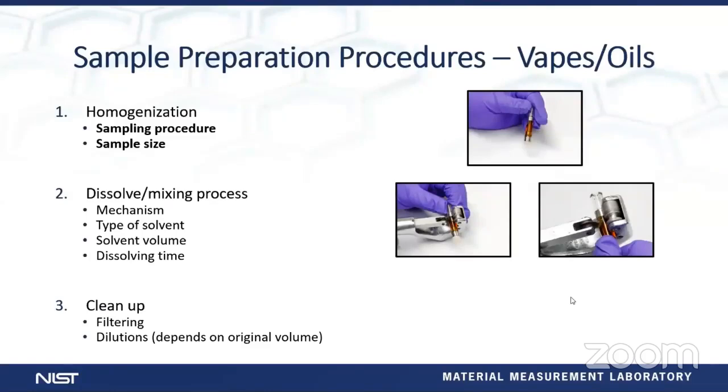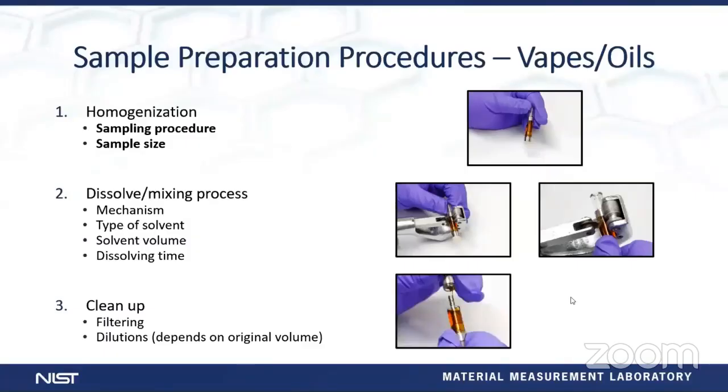And you have to do it very slowly and be very smooth in the cutting process. But we haven't had any problems with breaking it completely as long as we took our time to cut it. And ultimately, you end up with a nice cut that makes it easy for you to scoop out the product that you're going to be analyzing.